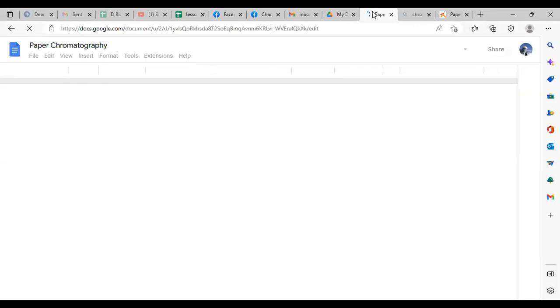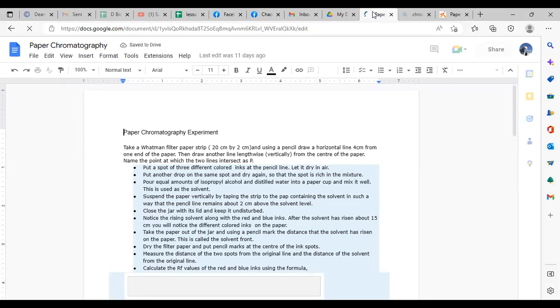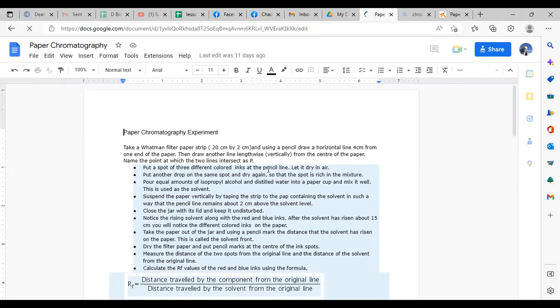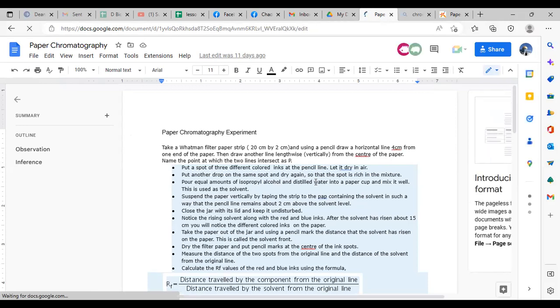So, punta tayo dun sa experiment. Meron kayong kahit ordinary water lang, kahit yung distilled water na mabibili sa 7-Eleven. Yung alcohol naman, nasa paper cup.